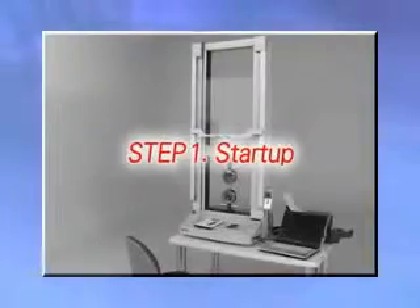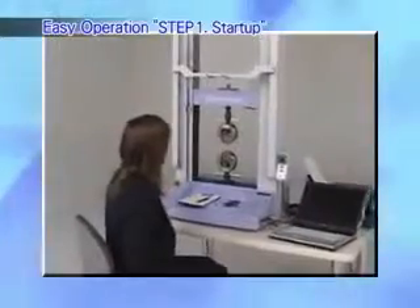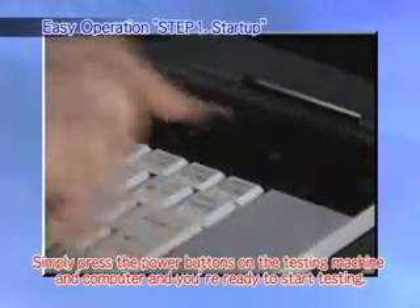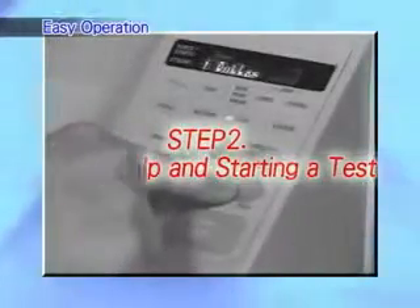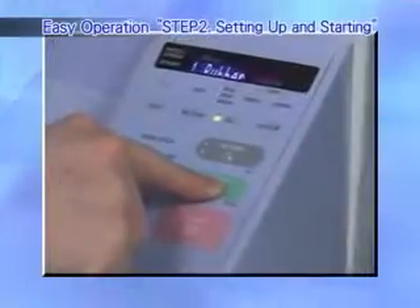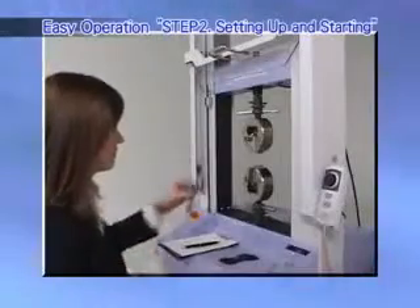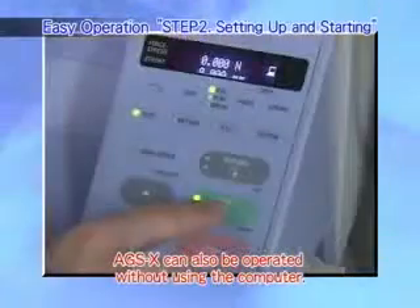Easy operation. Step 1: Startup. The AGSX can be operated easily by anyone. Simply press the power buttons on the testing machine and computer and you're ready to start testing. Step 2: Setting up and starting a test. If the test method is preset on the computer, the test method file can be recalled using the operating panel on the AGSX. Then simply attach the specimen and press the start button to start testing.